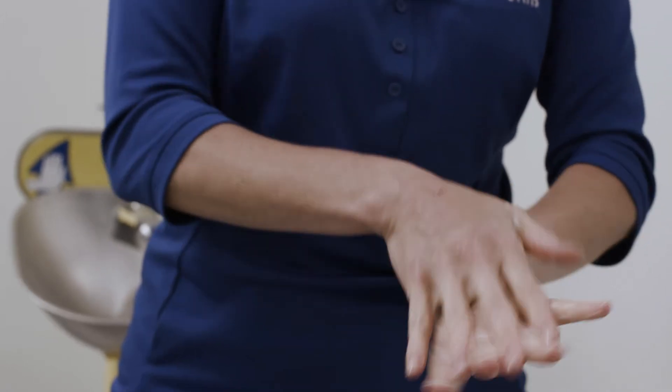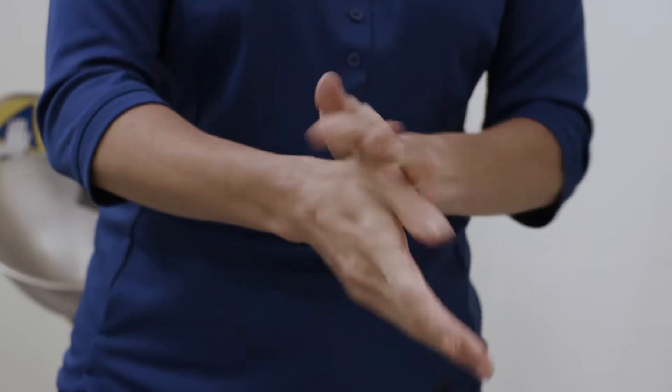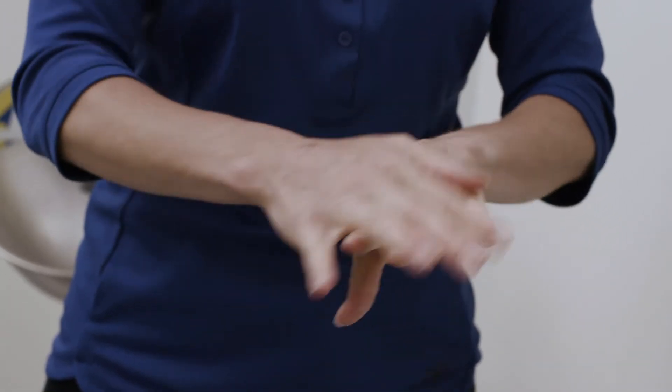When applying hand sanitizer, you should continuously rub in the sanitizer until your hands are completely dry. Hand sanitizer should never be used in place of hand washing.